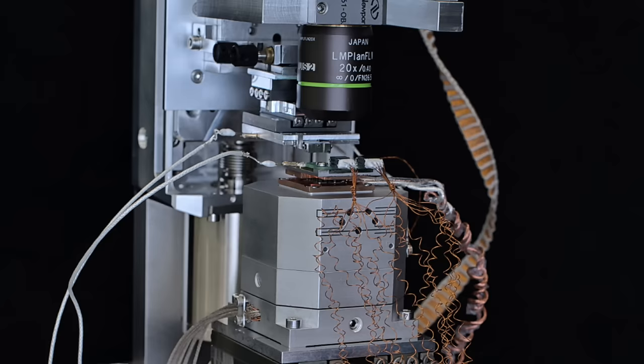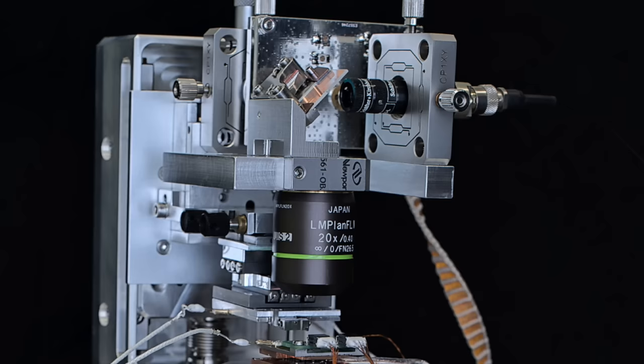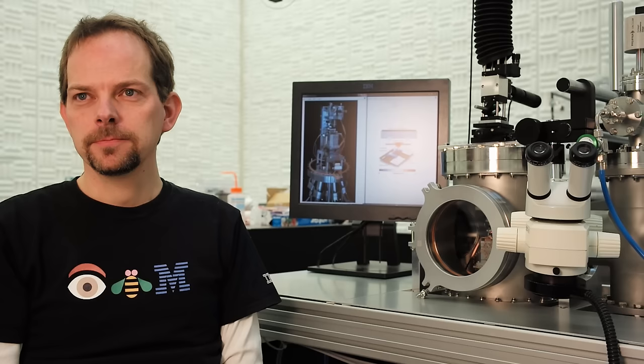Here we have the cantilever holder, where the actual sensing element of our thermal microscope is situated. And on the top part we have an optical beam deflection system, as you may find it also in a regular AFM, to detect the motion of the cantilever, which gives us information about the surface topography.